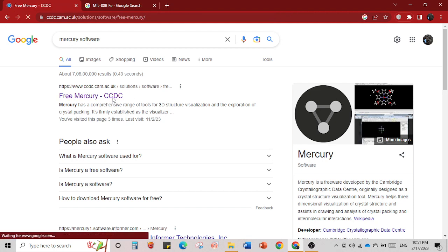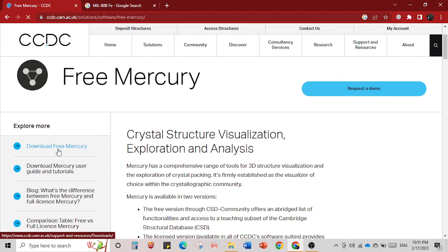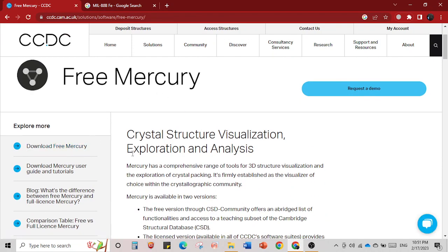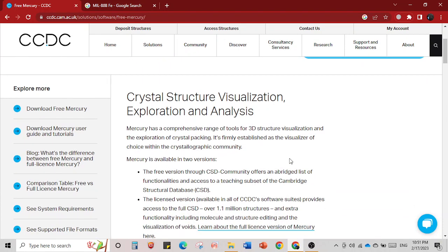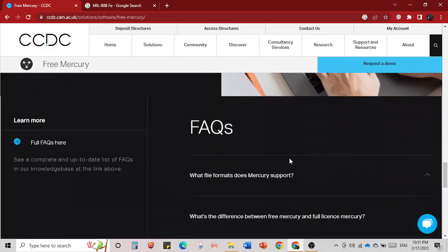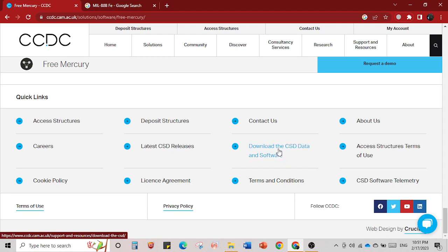I will tell you the easiest way to download it. There are a lot of ways: you can go to 'download free Mercury', it will direct you to a different page, or you can go to 'Research and Software' or 'Resource and Support' — everywhere you will find it. The easiest shortcut is to scroll down to the bottom and click 'Download CCDC CSD Data and Software'.